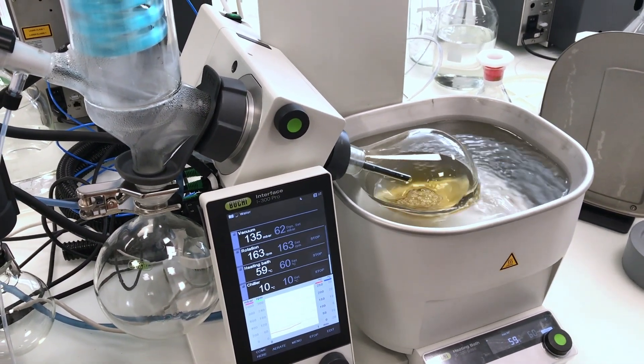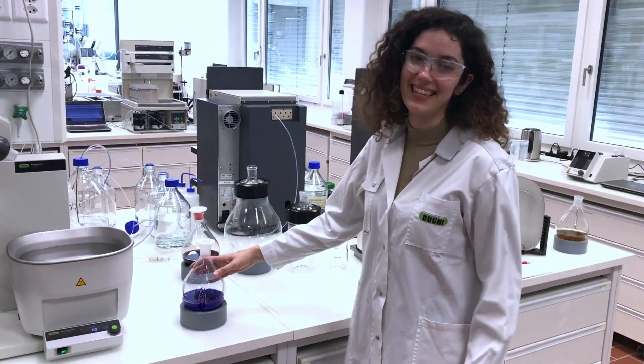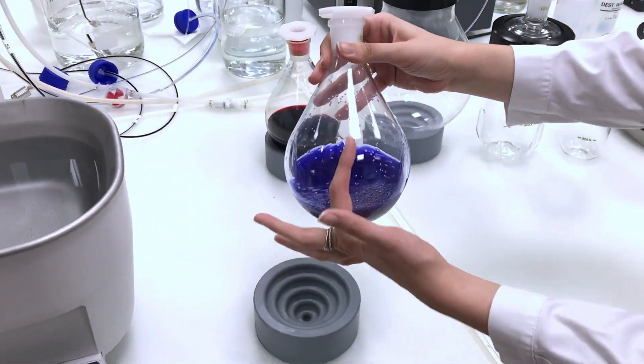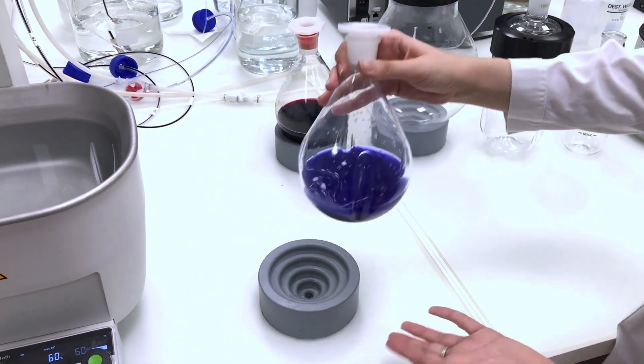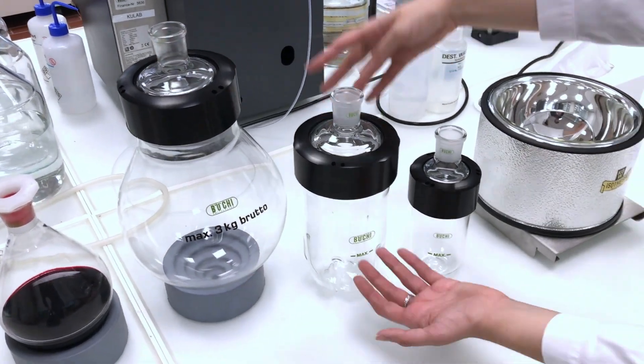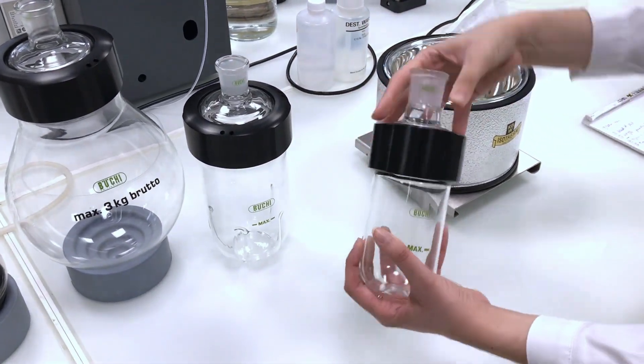So now we're going to see a bit of our accessories. This evaporating flask is flanged, as you can see, and it's for powdery compounds. Here we have what we call our beaker flask with a wide opener, so if you have a sticky sample that might be quite useful for you.